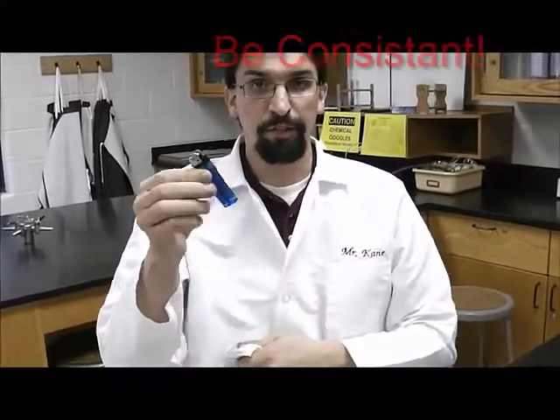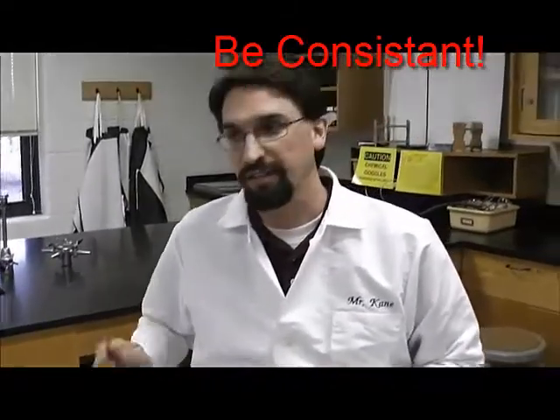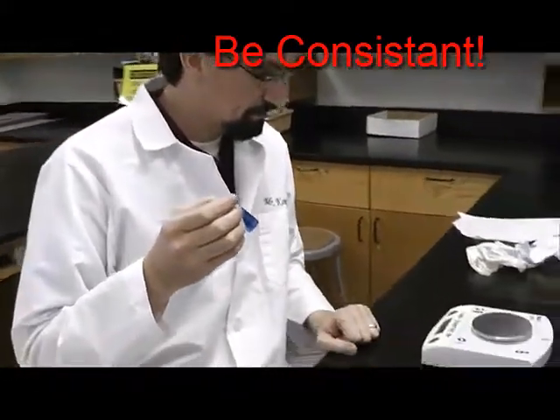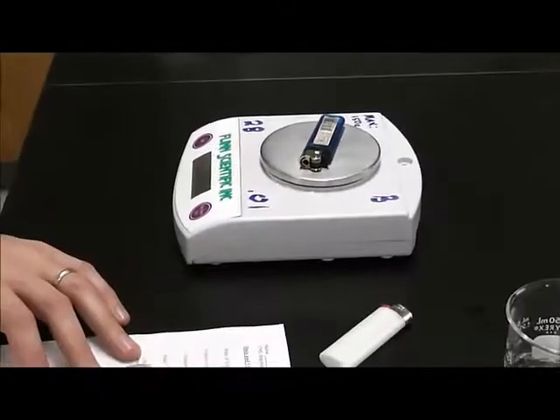Once you've read and recorded how many milliliters of gas you've collected, you want to again dry off your butane lighter, shake it 8 times, or however many times you shook it before, and dry it one last time. Be consistent. Then weigh it again. It definitely weighs less than it did before: 13.56 grams.